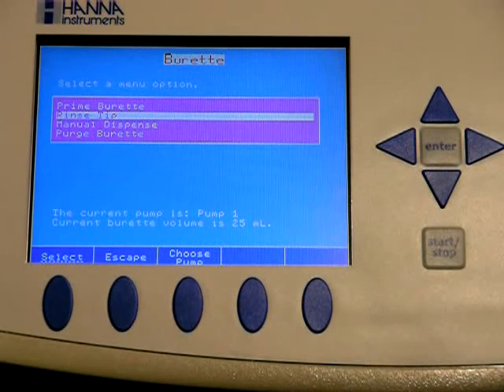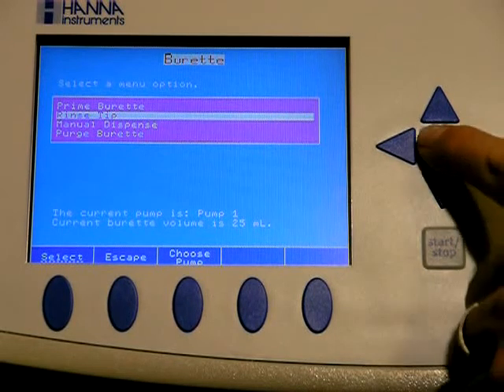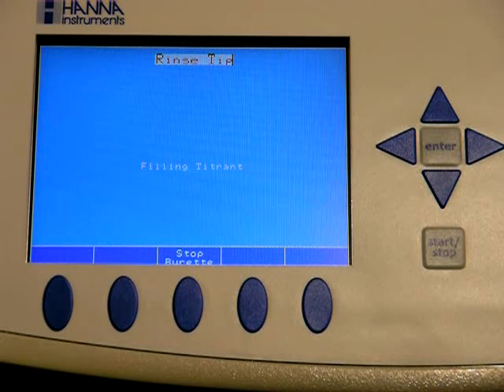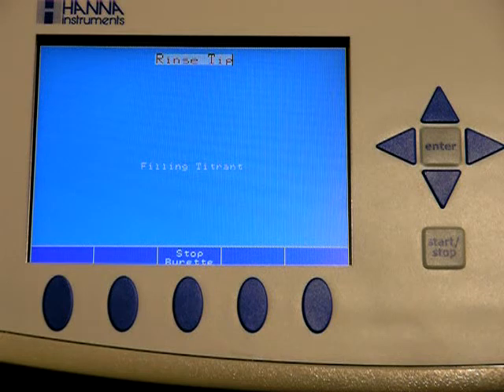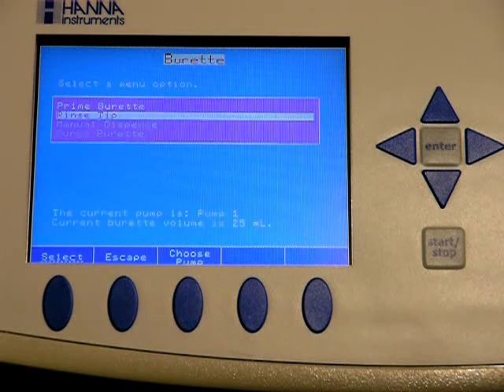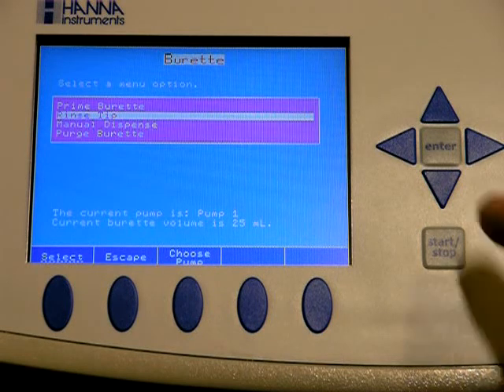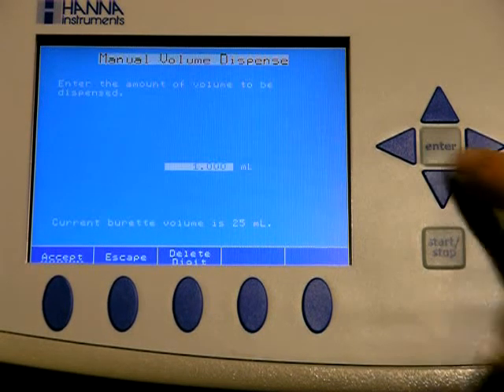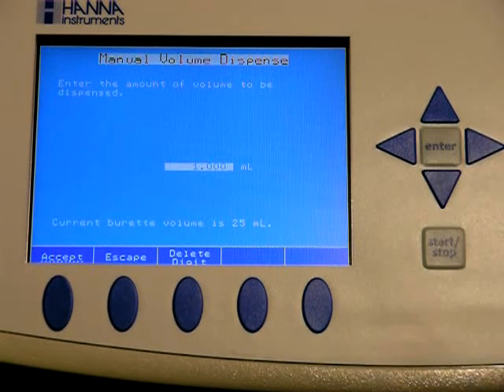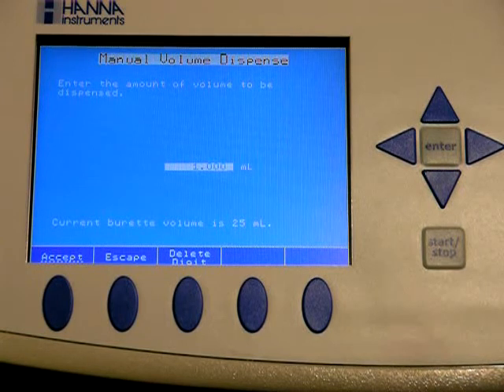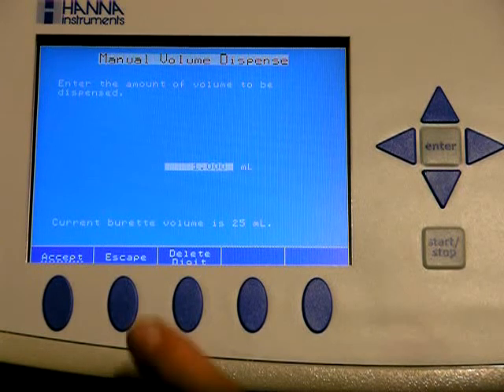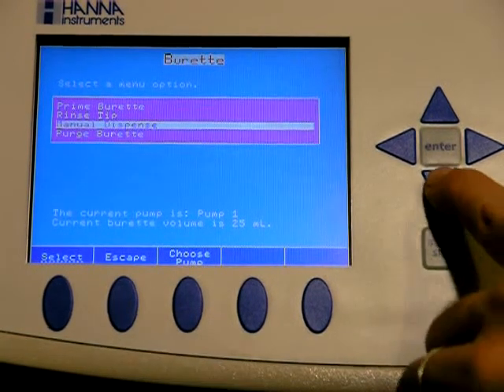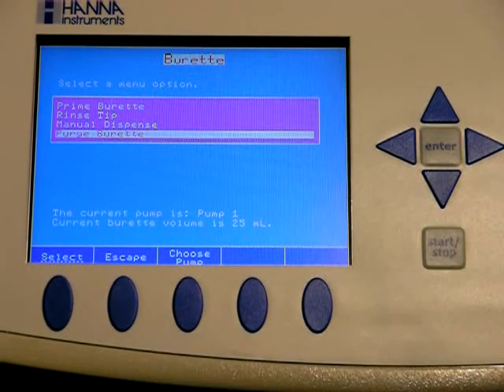Next will be a rinse tip. This simply dispenses one milliliter real quick and then fills itself. Manual dispense is similar to a rinse tip except you select the amount for it to dispense.